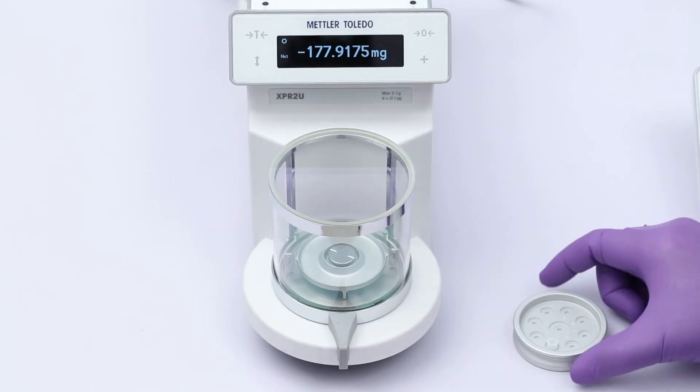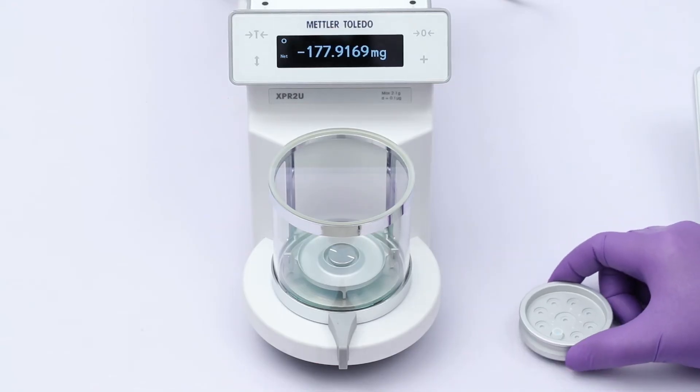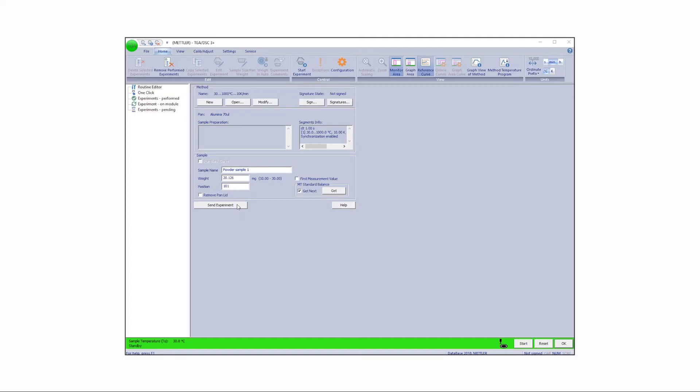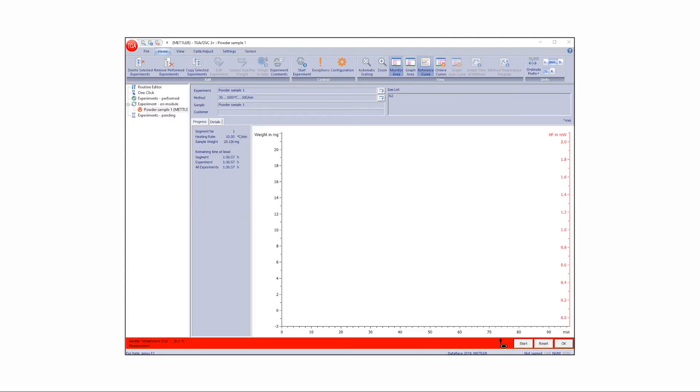Place the crucible containing the weighed sample onto the TGA turntable. Send the experiment to the module control window in STAR-E software.